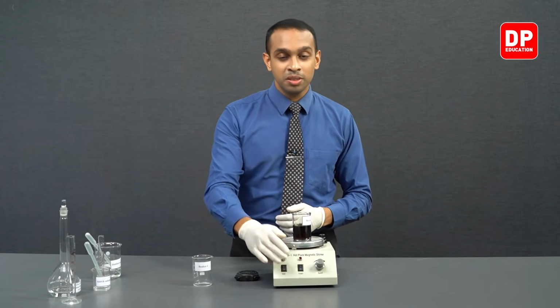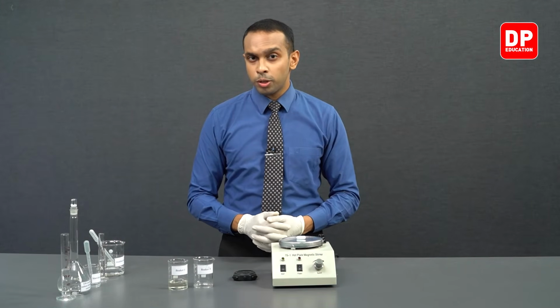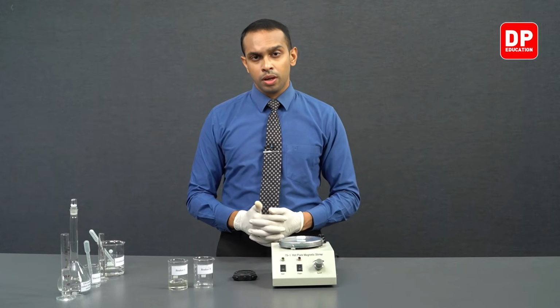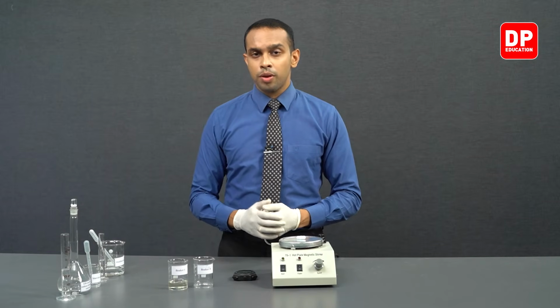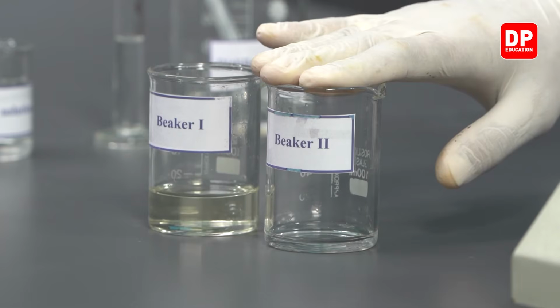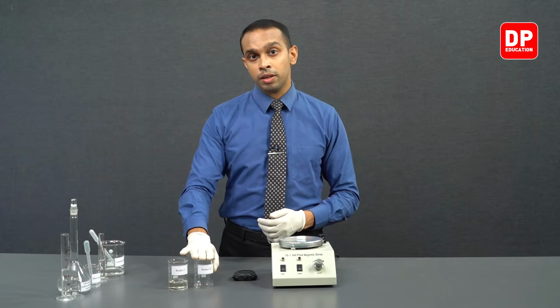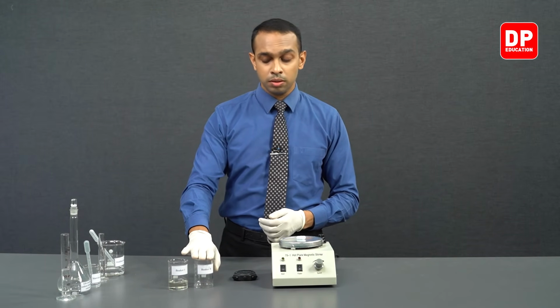Let's move on to the third reaction. Students, now we move on to the third reaction. In the third reaction, we will take only 4 cubic centimeters of our potassium iodide solution. So the iodide ion concentration in the final reaction mixture will be further reduced.